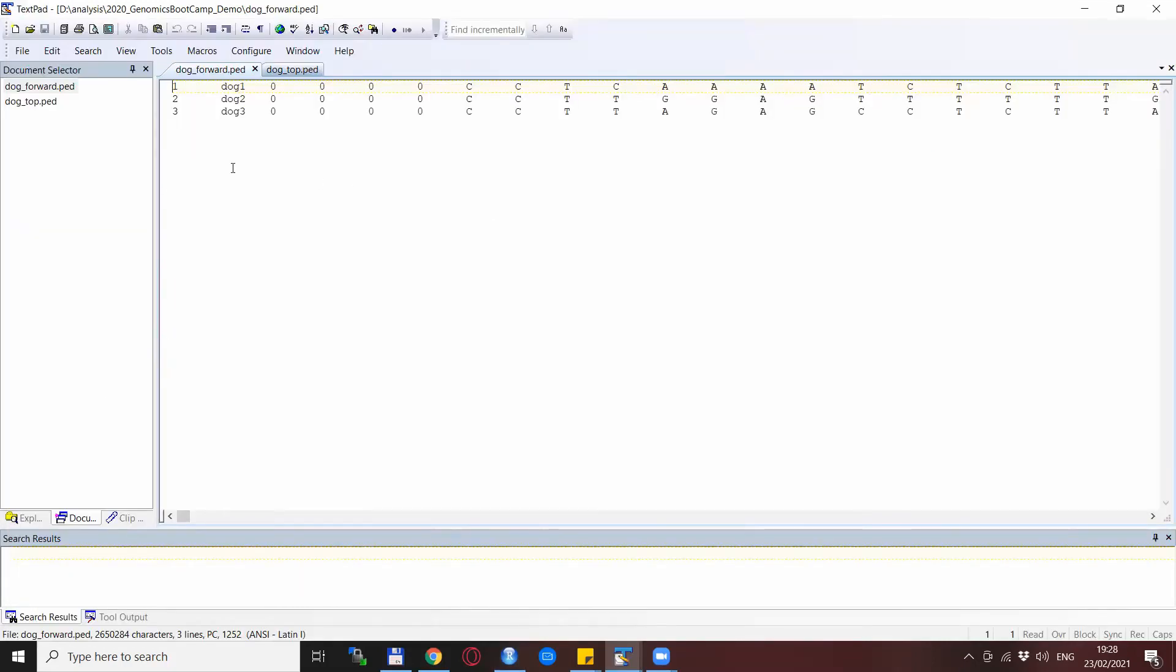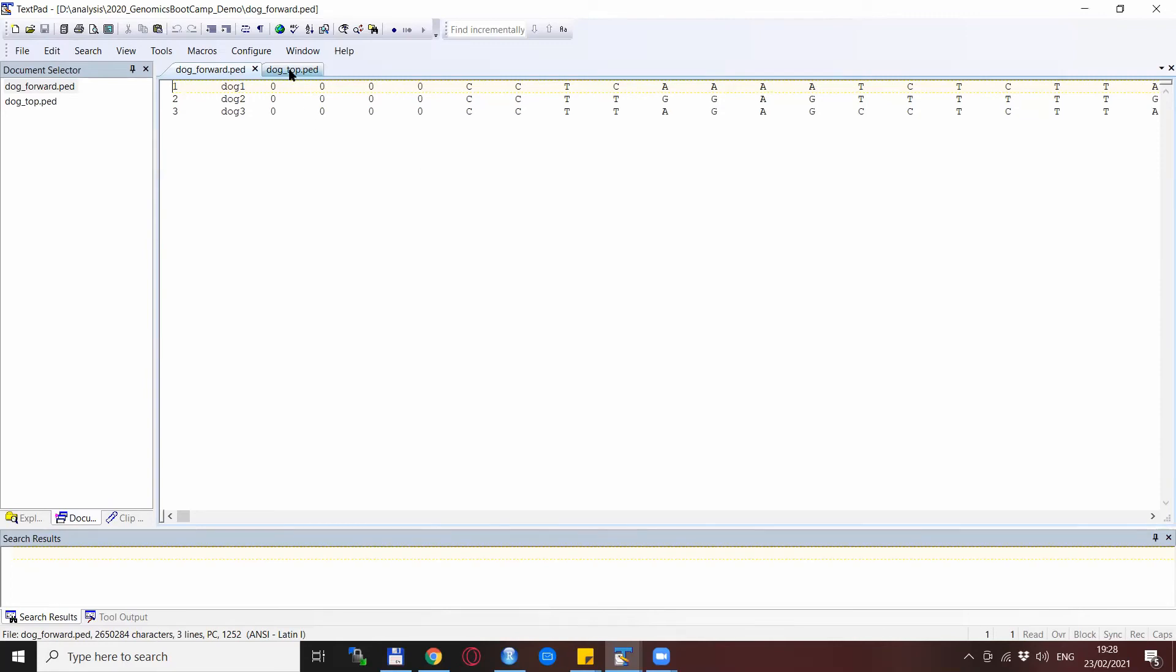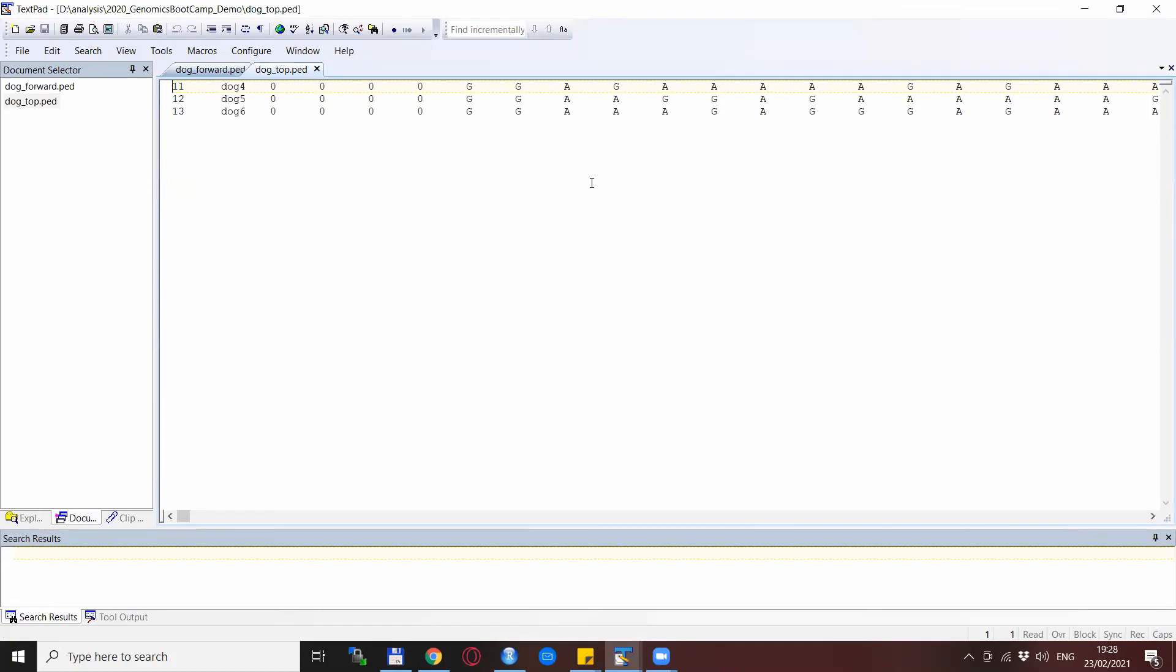So you see here that we have three animals coded in the nucleotide coding, and if you would scroll you would find that the missingness is coded as 0. And the other dataset also with three dogs, and if you would scroll and find also that the missingness is coded as 0. So here nothing strange is happening at first sight, but because one is coded in a top format and the other is the forward format, then some of the alleles, or actually some of the SNPs, are not coded the very same way.